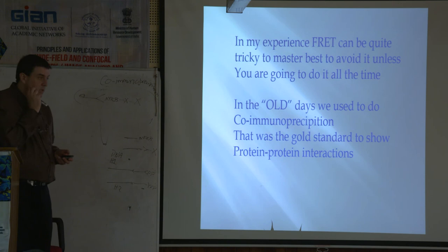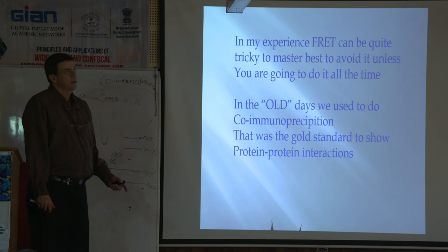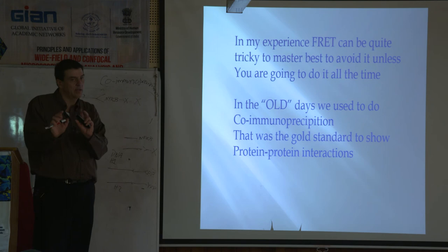Yeah, as long as the CFP and YFP can get close enough to work, it can work. Well, no, because remember, the big protein is still only going to have one CFP stuck to it or one YFP stuck to it. So it's not like there's more of it. Well, I mean, there could be because you could have a whole bunch of them there. But as long as they get close enough, it should work. I'm no expert on FRET, don't get me wrong. I've done it, but I am by no means an expert.